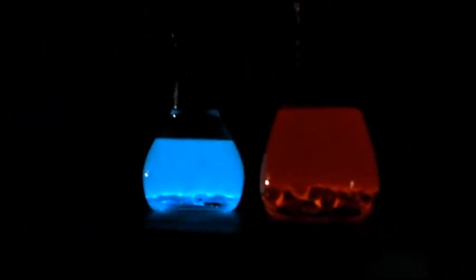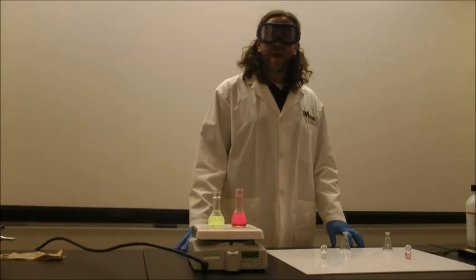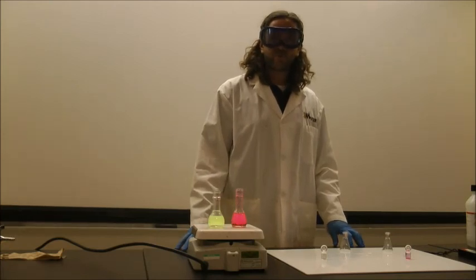Chemical reactions happen at different speeds at different temperatures. And so, if we heat these solutions up, then we should see them glowing brighter. As you can see in this time-lapse video, as the reaction warms up, it gets brighter. So that's our chemiluminescence reaction.